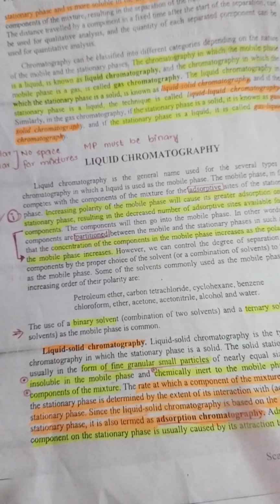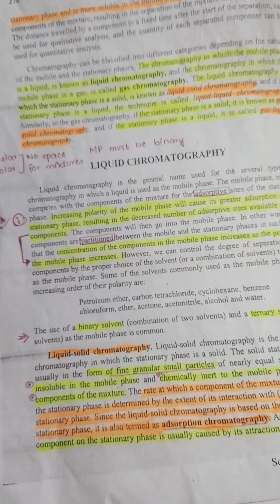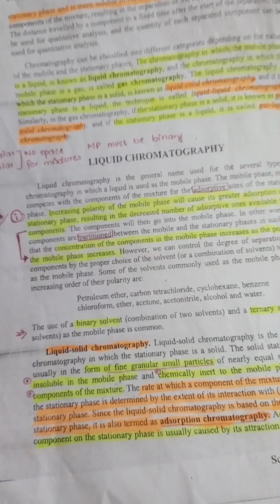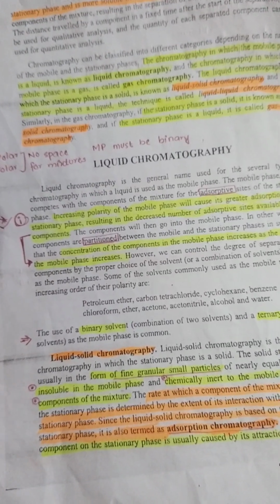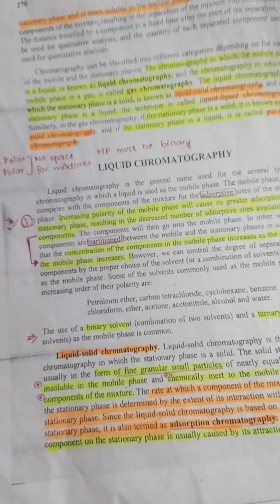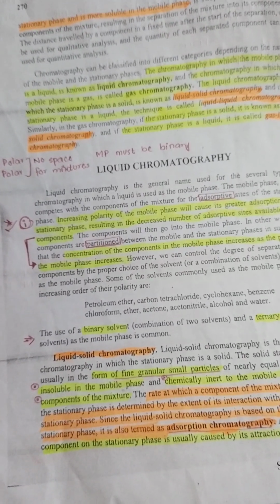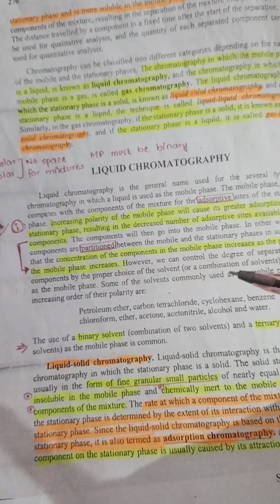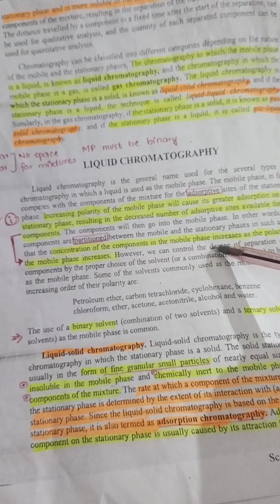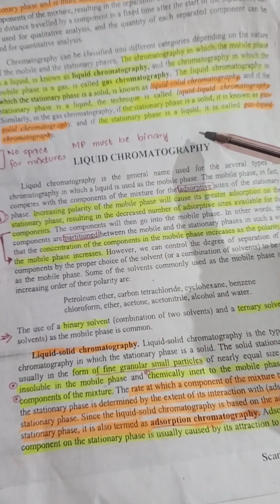What is a binary solvent? A combination of polar and non-polar. Why is it necessary? Because we don't know the nature of our component or our mixture. The components are separated on the basis of their nature. Most of the time our stationary phase is polar. The polar component is adsorbed on the stationary phase, and the less polar component sweeps through the stationary phase.